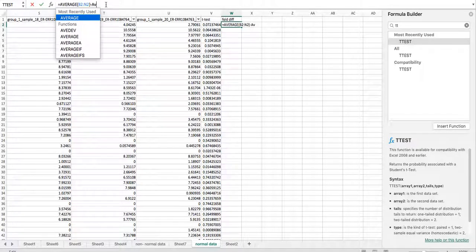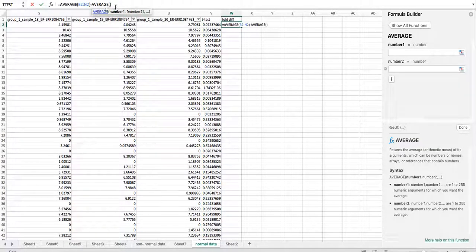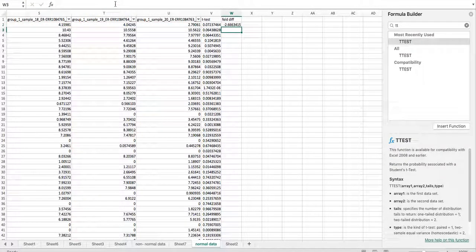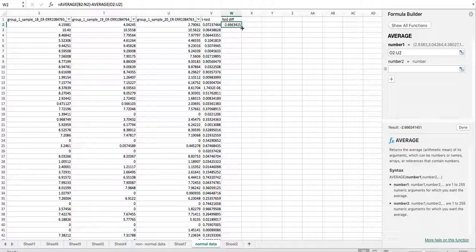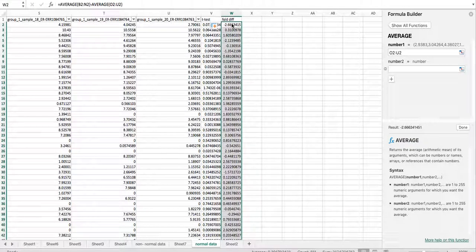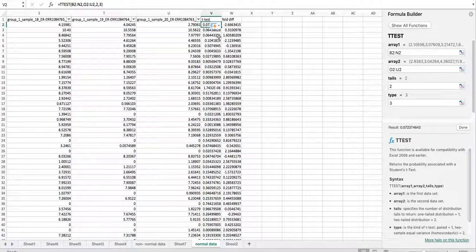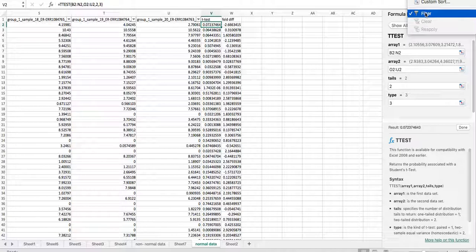And the average of the second range. There are two ways we can analyze this. Again, we want a t-test p-value of less than 0.05, so here we will just hit Filter.